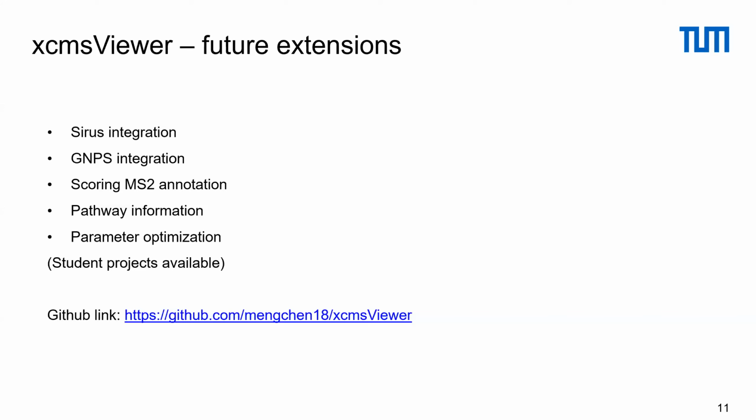Thanks. So we actually got some questions now. Manfred Repke is asking if you can use the XCMS Viewer for GCMS data. We have not done it, and I'm running the GCMS in our lab. We just have a low resolution mass spec, so I don't think that would work properly.